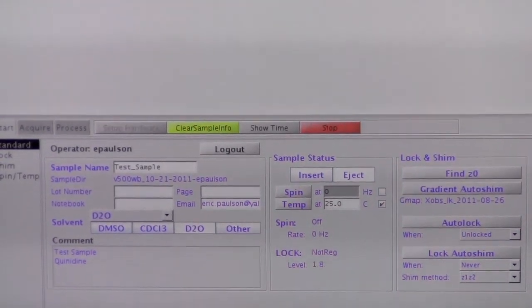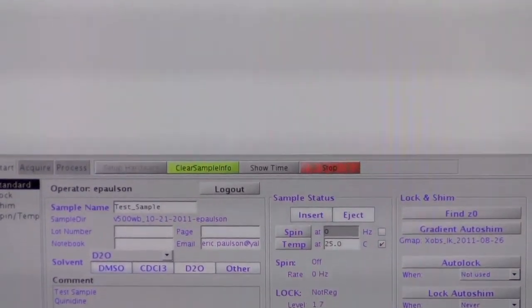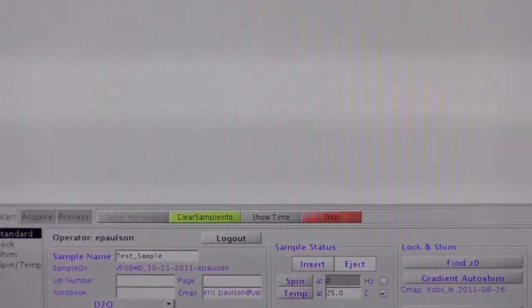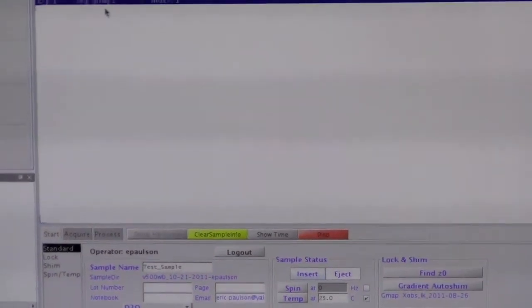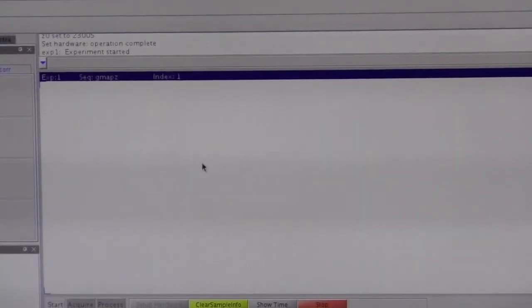Okay, it did the auto lock. And now the experiment is set to GMAP-Z, which is the experiment that it uses for gradient shimming. And we can see the progress bar down here is doing some gradient shimming.